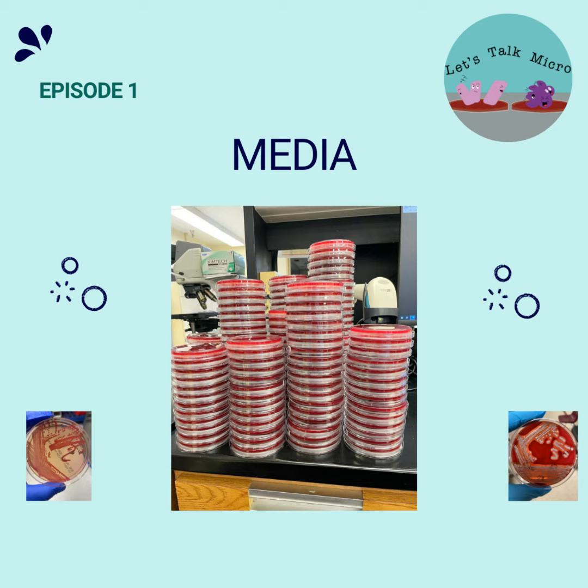And then which agar do we choose? You can have a slight variation from lab to lab, but basically they all have the same. It's from the American Society for Microbiology. They create these standards for us. So basically your standard culture has blood, chocolate, MacConkey, and then depending on some sources, you add, like, Martin Lewis if it's a genital source.